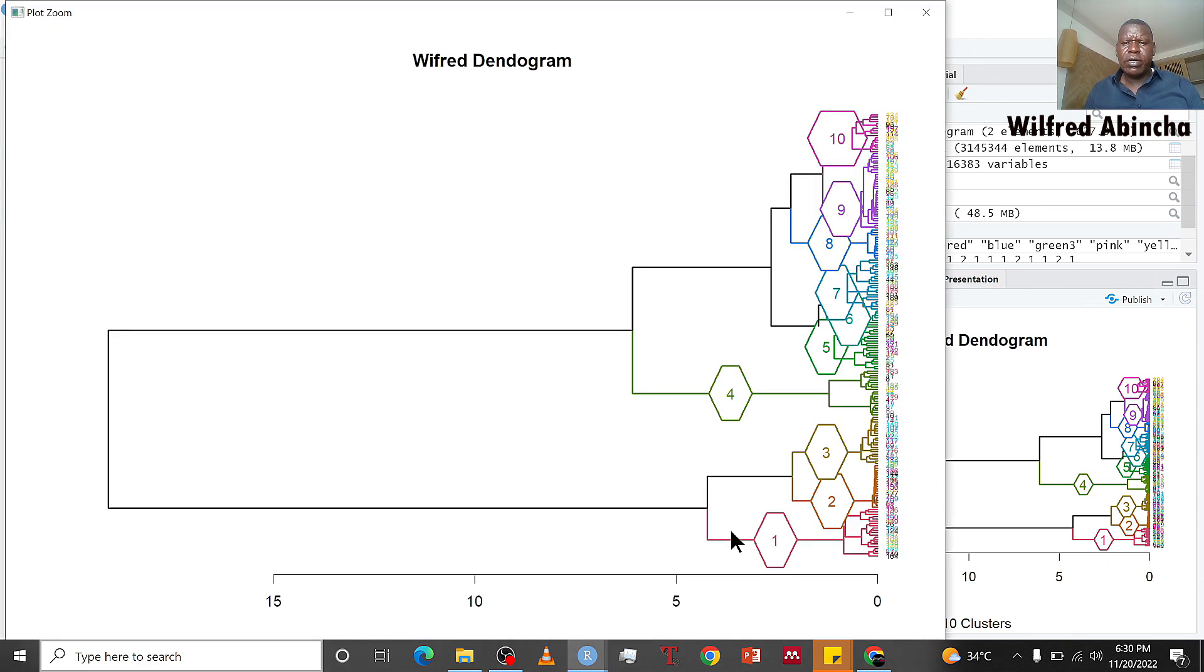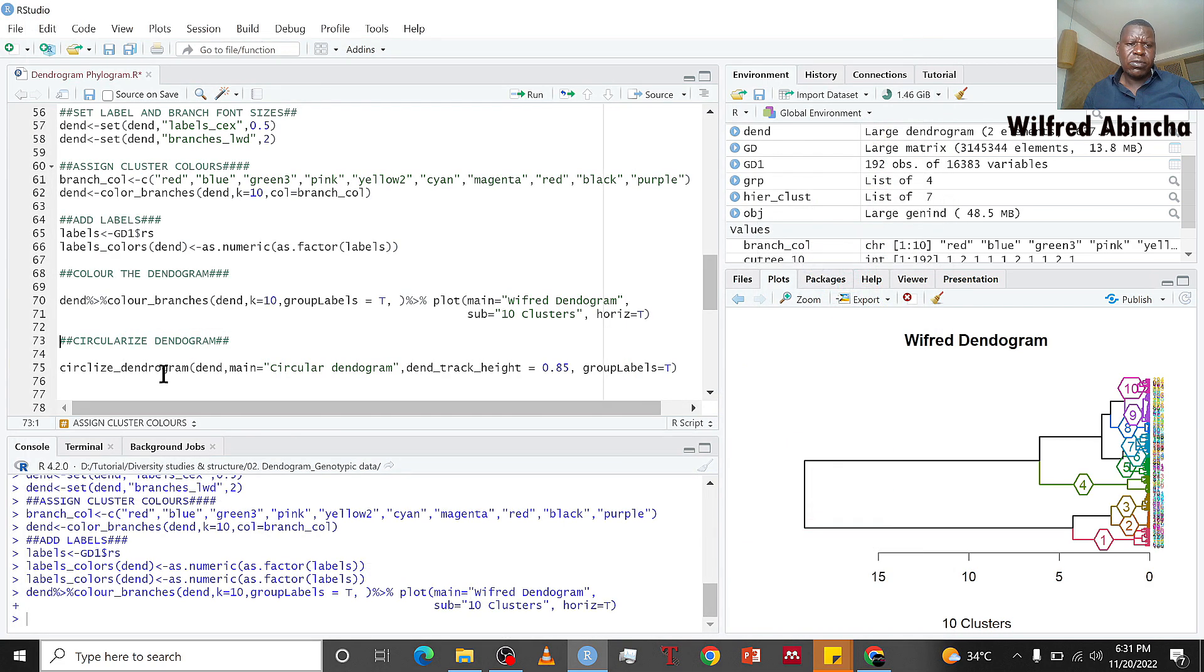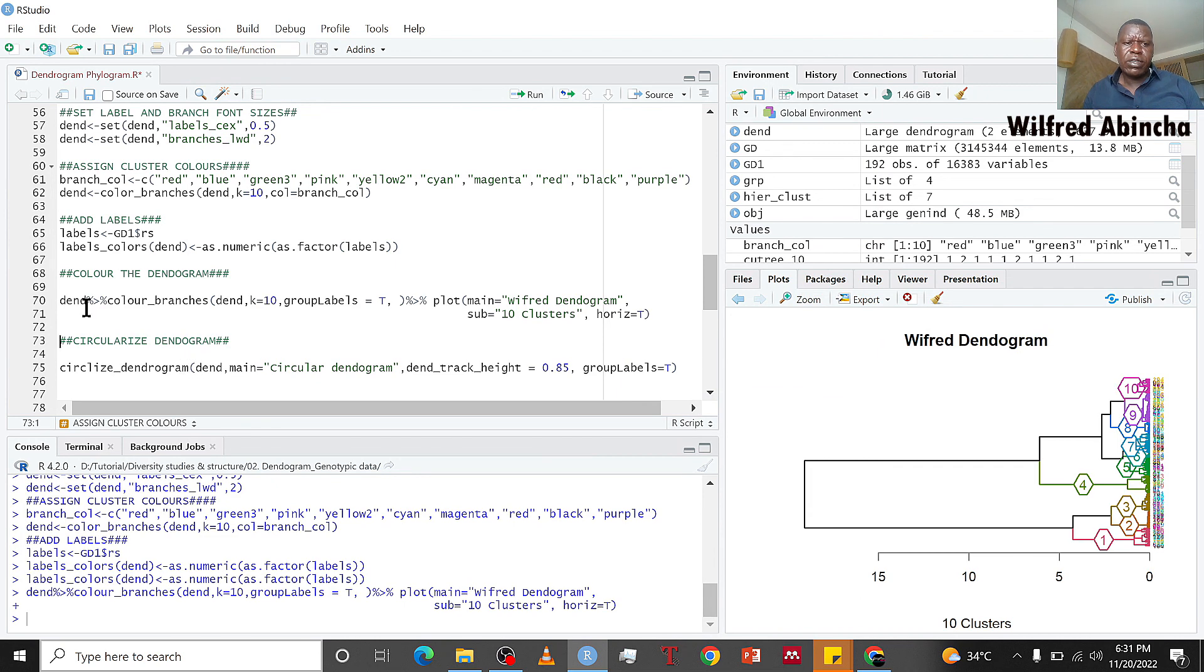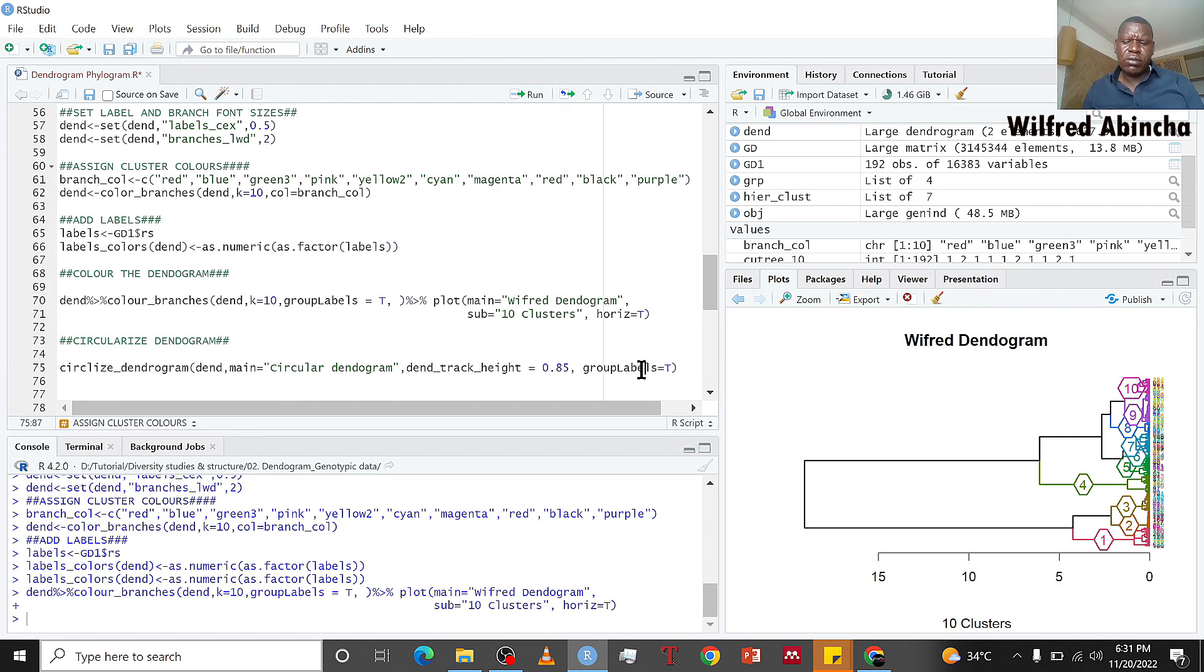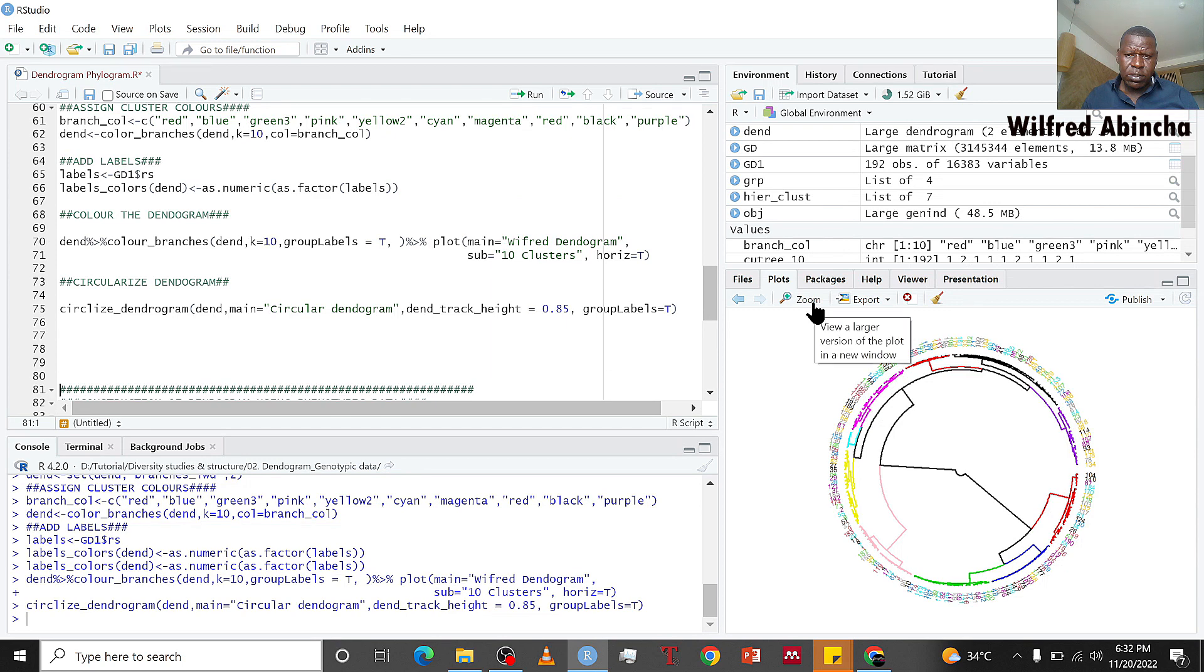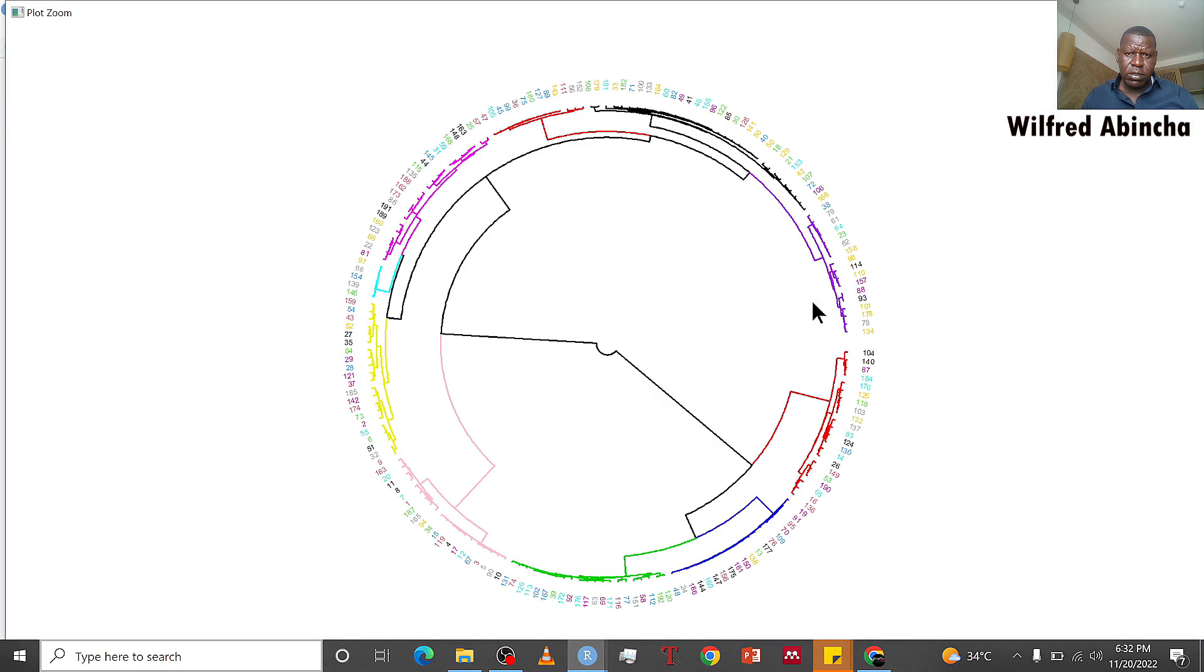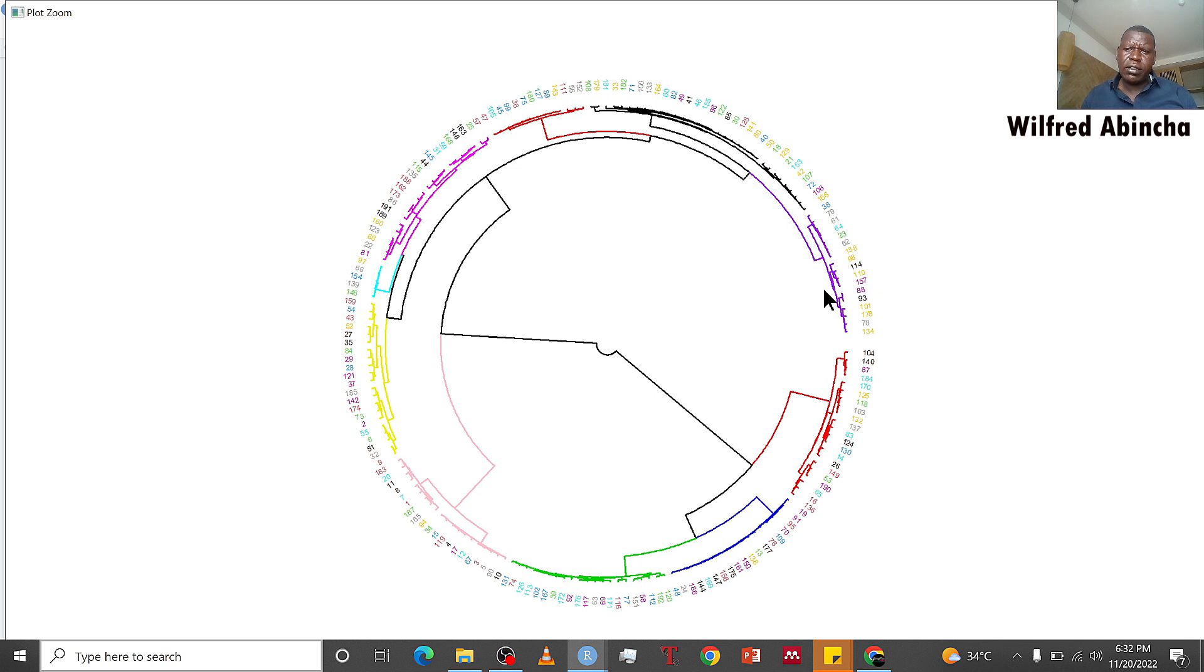Because you can't view this correctly, we circularize this. You use circularize_dendrogram and we are circularizing this dend. We call it circular dendrogram with specifications like heights and labels set to true. This is our circular dendrogram. We have 10 clusters. Let's start counting from this red one: two, three, four, five, six, seven, eight, nine, and these are the labels, your genotypes.